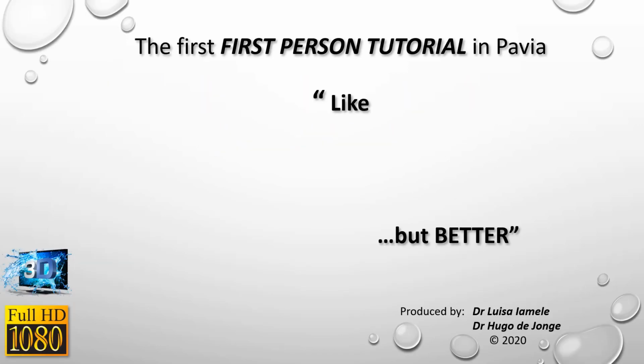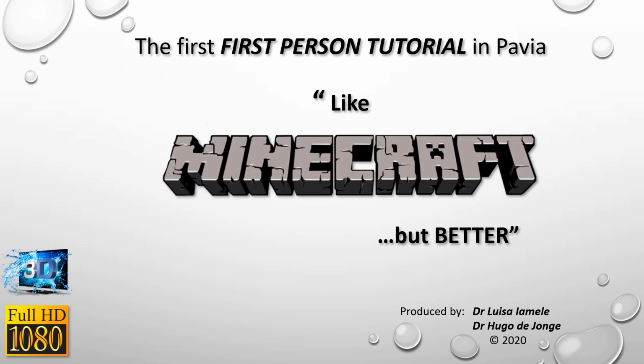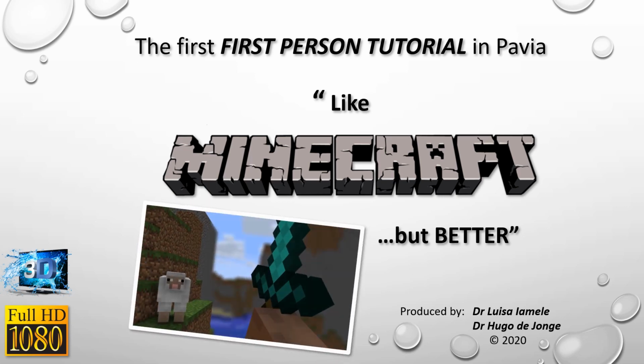This is the first-person tutorial in Pavia, and it's a bit like Minecraft, but better. We really try to present you with two different experiments that you would have done yourself if it was not for the coronavirus crisis we're in. So with this special format, we hope you can still enjoy doing the experiments yourself. And even though it's not in 3D, we did try to provide you with a quality full HD experience.